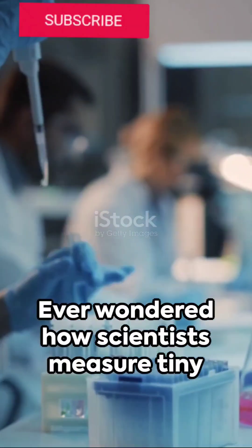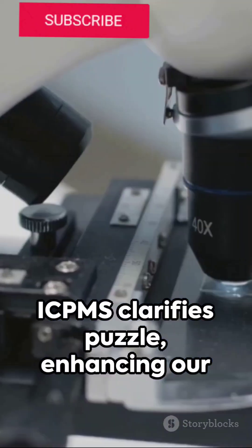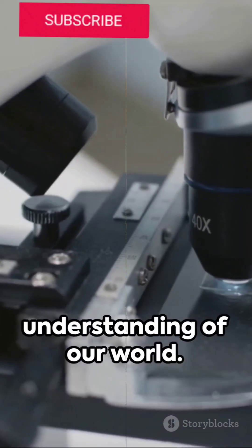Ever wondered how scientists measure tiny element concentrations? ICP-MS clarifies the puzzle, enhancing our understanding of our world.